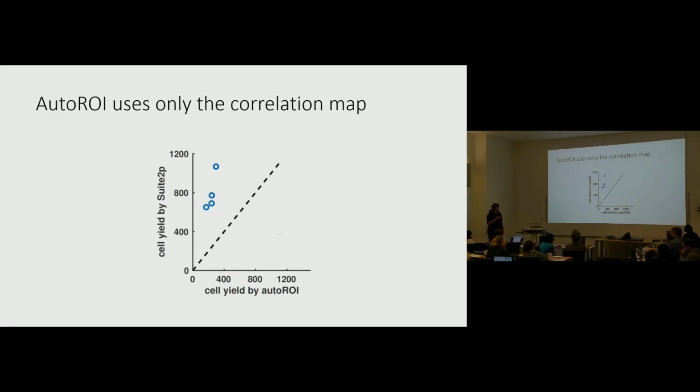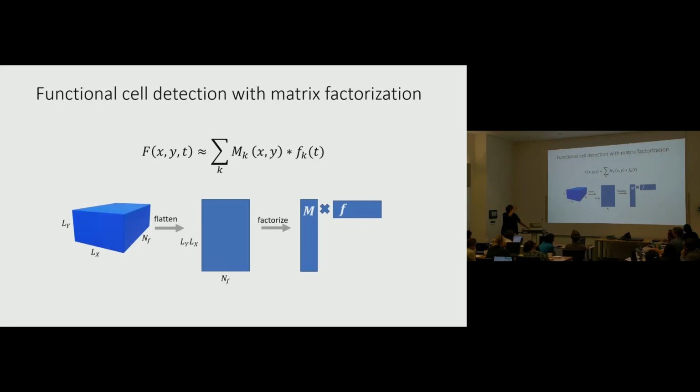Okay, so that's good. We can get more neurons in a more automated way. This was also a little bit manual. Now, to do this peeling off, we need a pretty good model, in fact, of what the cells are, right? We can't just say, my cell is a blob that I'm going to subtract off from there, because if you don't subtract all the pixels of the cells, you'll still get pretty bright pixels left there. And so this is where that kind of generative model comes in, where we want to have a little bit of a sense of how this data was created.